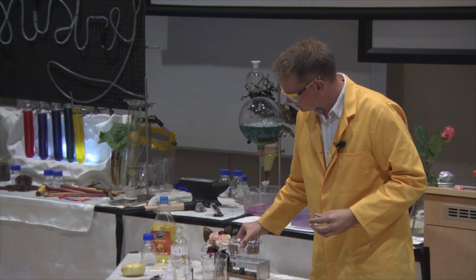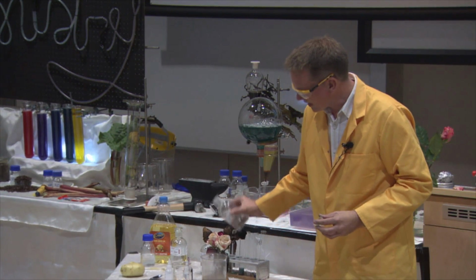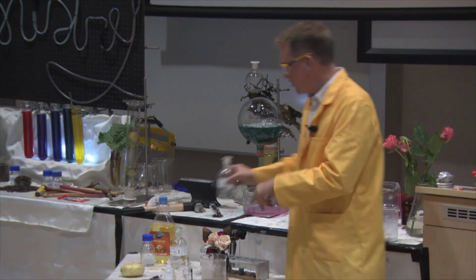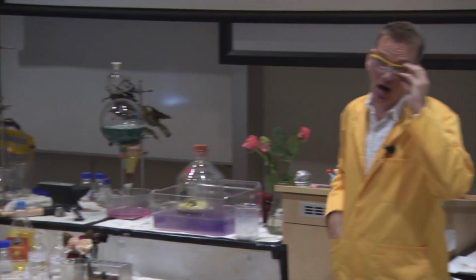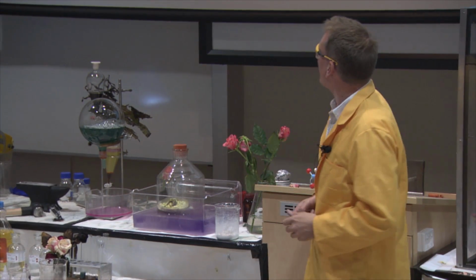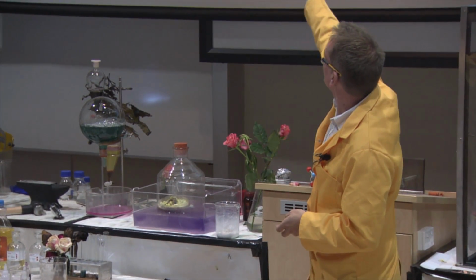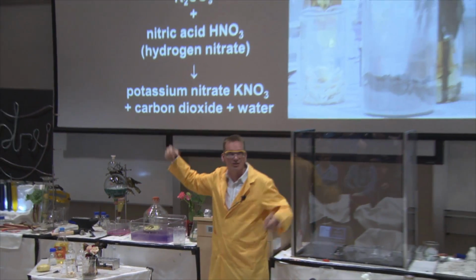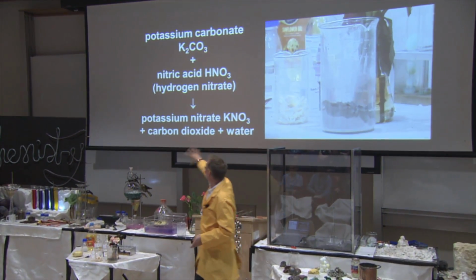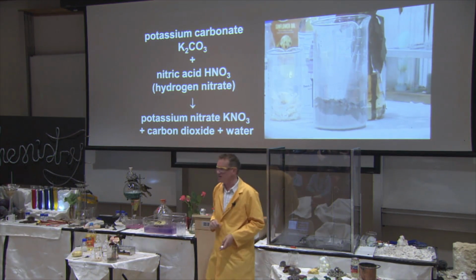And yes, it's certainly fizzing away. And this confirms that there is a carbonate there. This carbonate is potassium carbonate. There's some of that in there. In fact, the reaction there, potassium carbonate reacts with our acid. This was nitric acid. We get potassium nitrate. Well, that was our saltpeter that we used in our gunpowder. And carbon dioxide, the bubbles that we see.